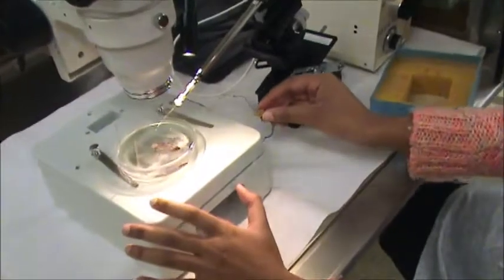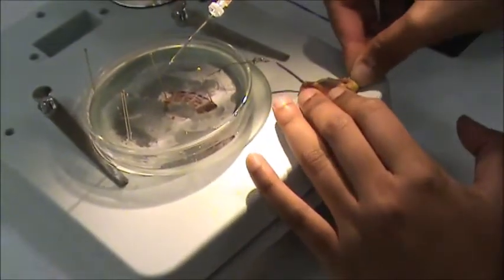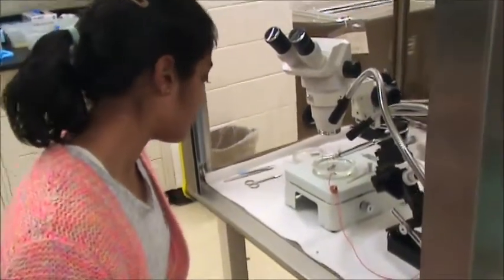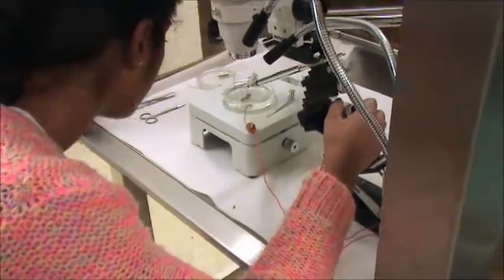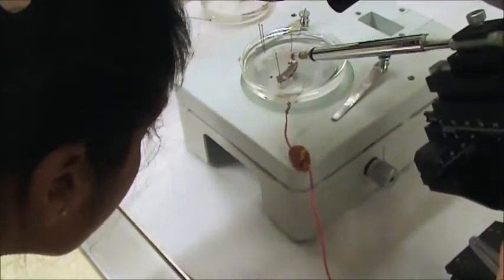One more thing we need to put in there is our ground wire, and you'll have a little piece of clay to stick it on there so it won't move around too much. Now we're going to test the resistance of the electrode. You're going to want to carefully put the electrode in the saline and make sure you don't break the tip.